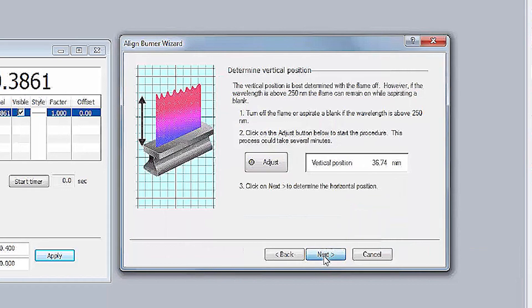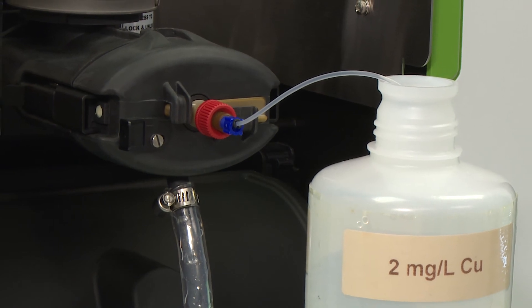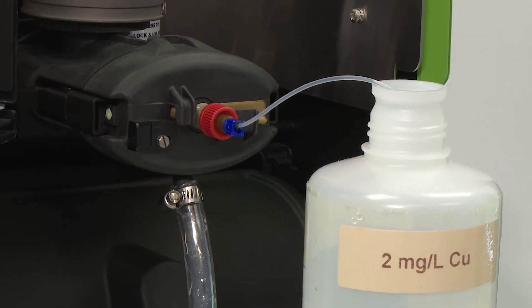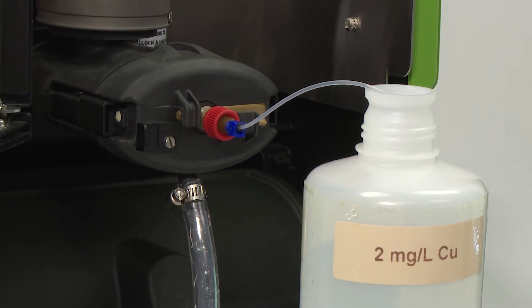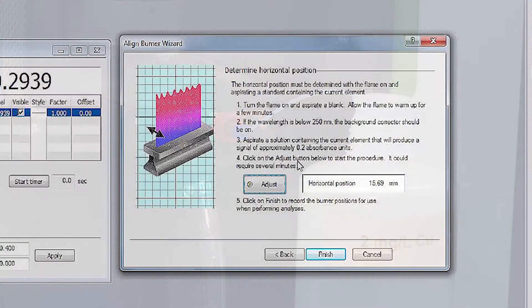Now horizontal alignment of the burner is performed. As indicated by the wizard, this position is best determined by aspirating a solution of setup element that will produce approximately 0.2 absorbance units. Click on the Adjust button to automatically align the burner's horizontal position.